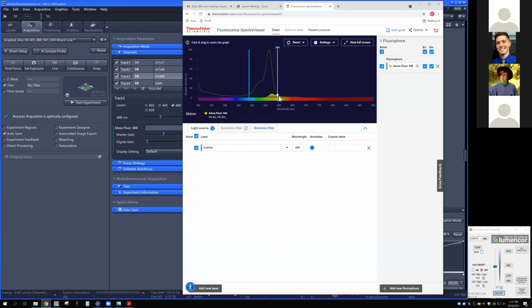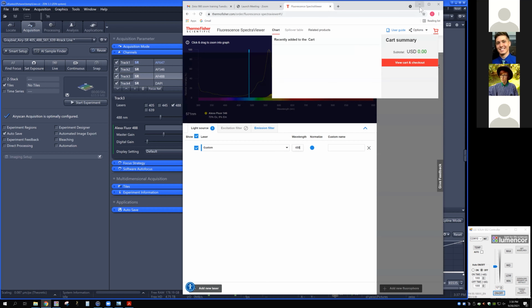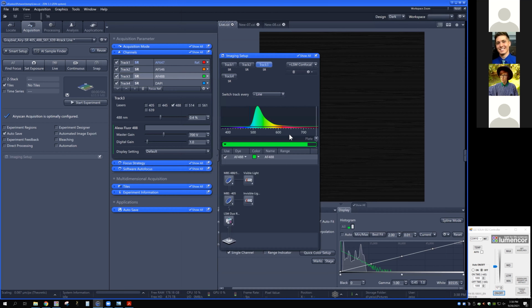And so the combination of four fluorophores that you're working with here is likely going to be not a very good choice for trying to do a line switch with Airy Scan. Does that make sense? So I'm going to leave it here anyway. I encourage you to try it out and very likely see crosstalk, and then we'll move on and I'll do a frame switch configuration for you instead.